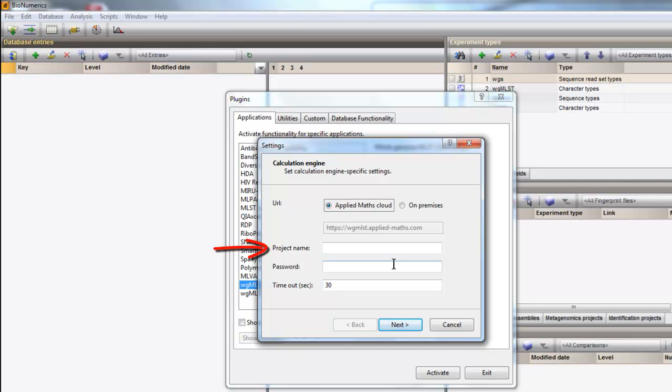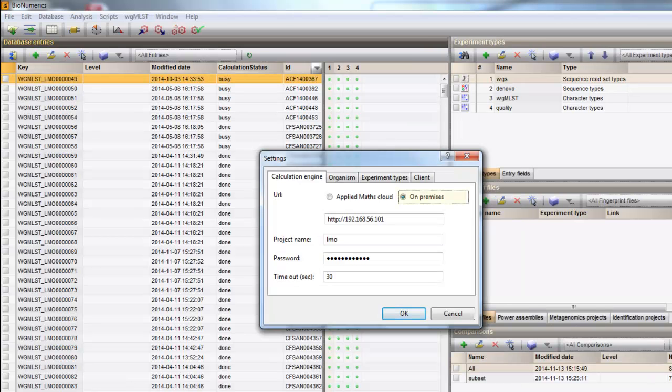And second, the project name as you obtained from Applied Maths and the corresponding password. In this case, I will use a local setup.